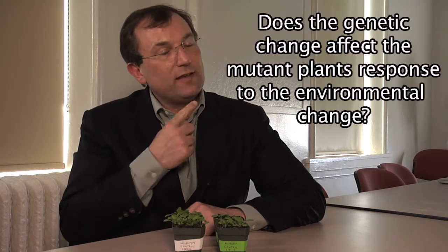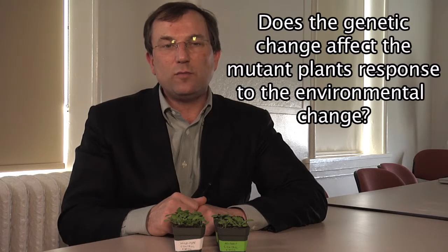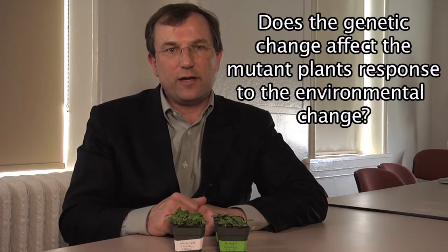Remember, these are the ones I compared to examine the effects of the genetic change. And here are my 2 wild-type pots, the ones I compared to examine the effects of the environmental change. I'm going to compare the mutant plants grown under experimental conditions to the first 2 comparisons that I made so that I can answer this question. Does the genetic change affect the mutant plant's response to the environmental change?